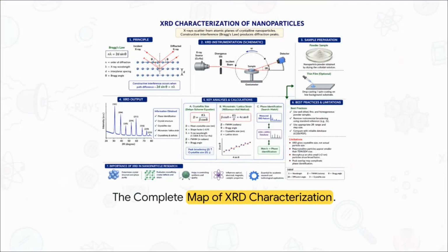Okay, let's dive right into this. What you're looking at is our complete map of XRD characterization. It looks like a giant puzzle right now, but don't worry, we're going to decode this workflow step by step. We'll trace the entire process from the core physics, through the physical machine itself, and finally into the math used to extract all that actionable data.